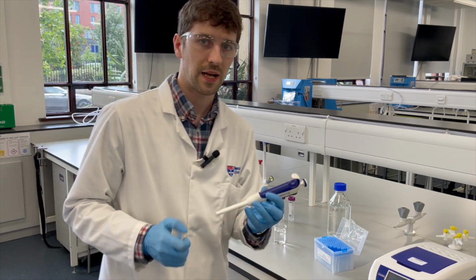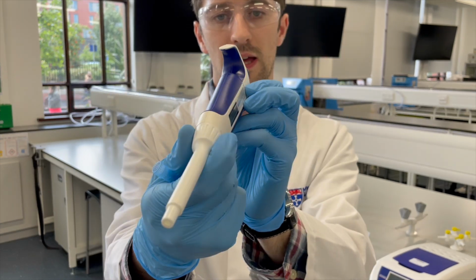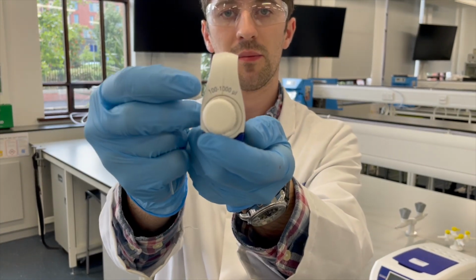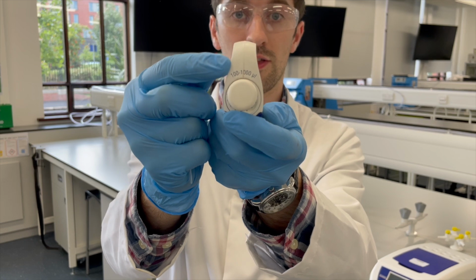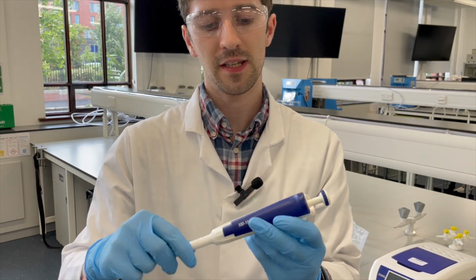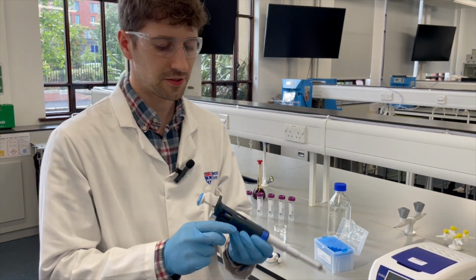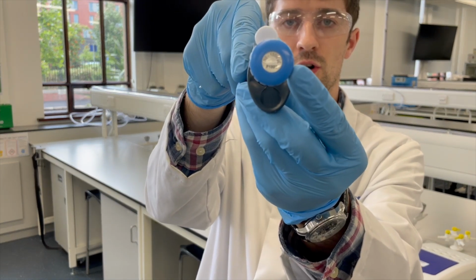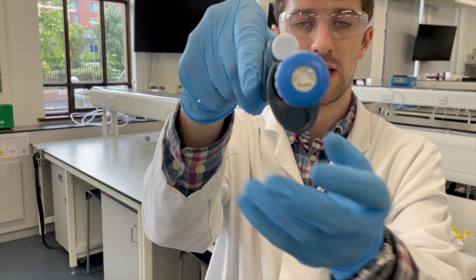For those of you that perhaps haven't seen an apparatus like this, it is called a pipette. The pipette is calibrated, and it allows us to deliver a precise volume of solution. This pipette, you can see, is calibrated between 0.1 mL, or 100 microliters, and 1 mL, or 1,000 microliters. And we can see that I've set this pipette to 1,000. Some other pipettes, like this Gilson pipette, also deliver a volume between 100 microliters and 1,000 microliters, or 0.1 mL and 1 mL.